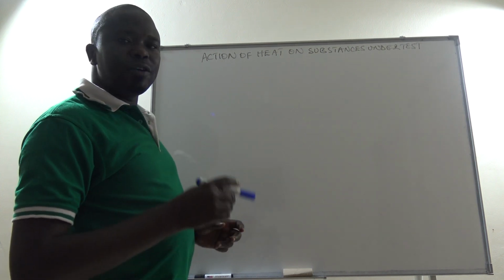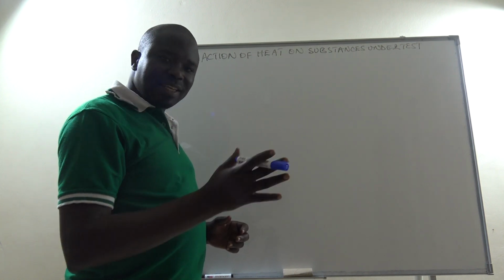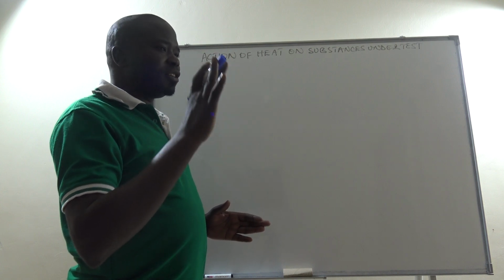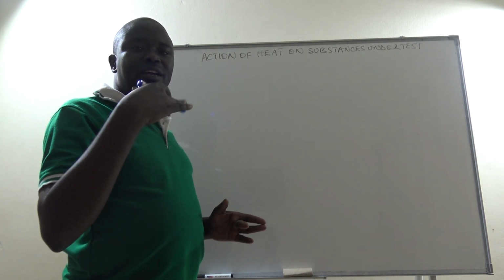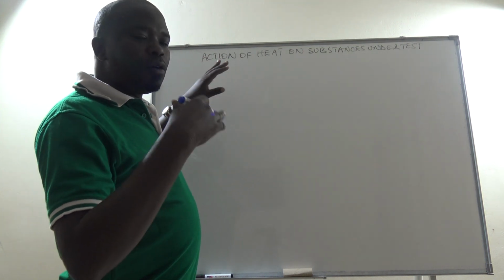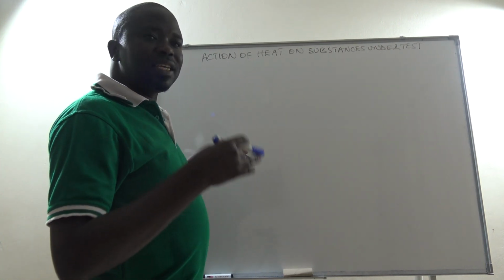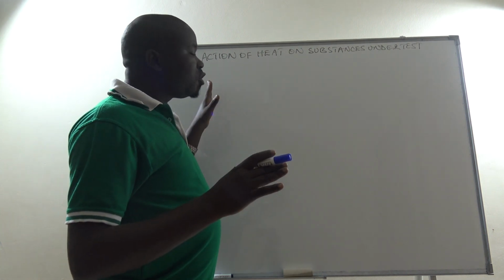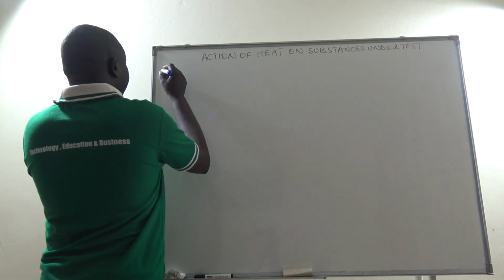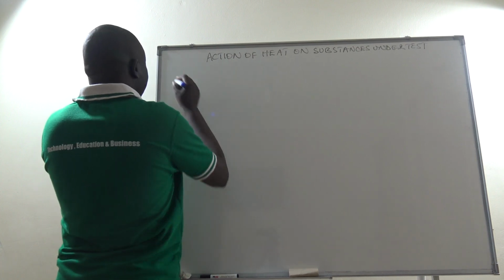So in this case we are going to see how to prepare for heating, how to do the heating, and then the expected observations and deductions. In fact, observations that we expect to make during heating. And then we shall have an in-depth look at those observations. In case you make one, then what should be your deduction in this case? So let us try to see the test instruction, or how we should do it in this case.